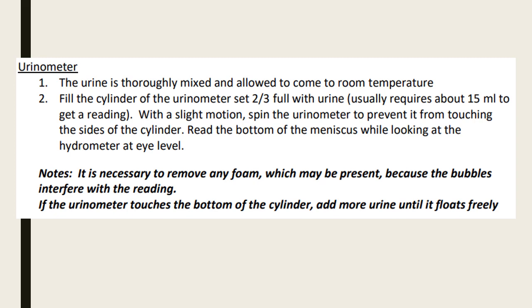How are you going to use your urinometer? Of course, you mix your urine thoroughly and allow it to come to room temperature.